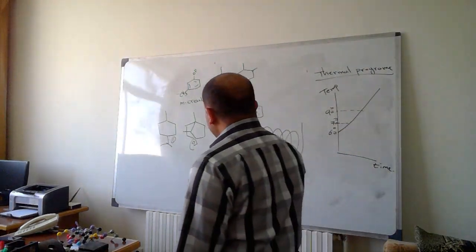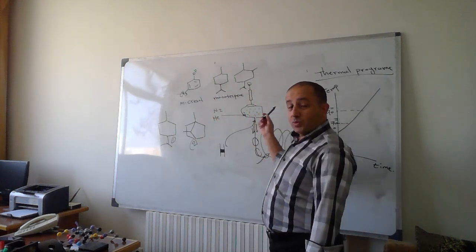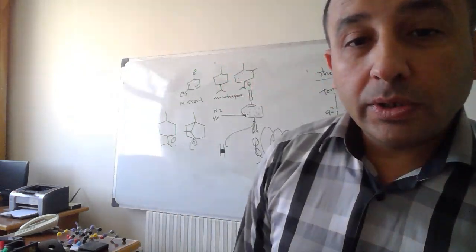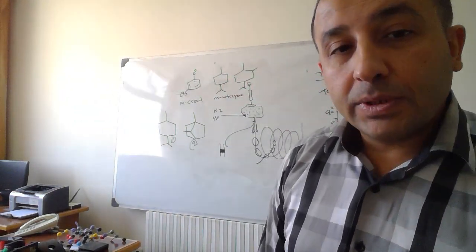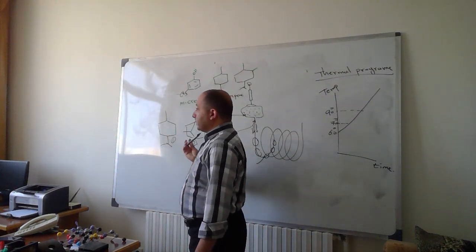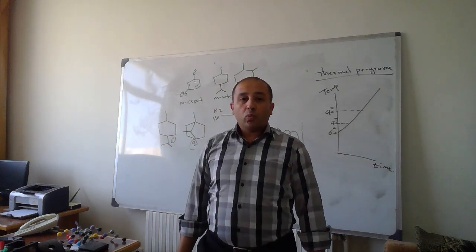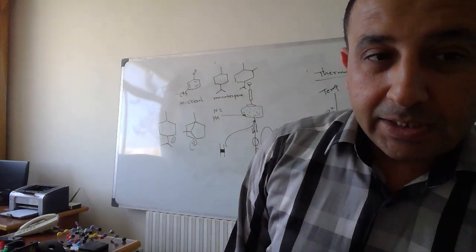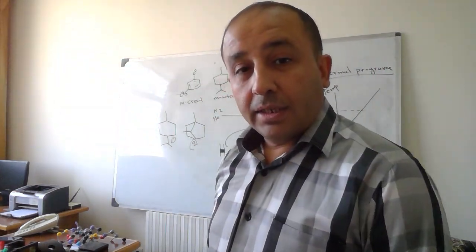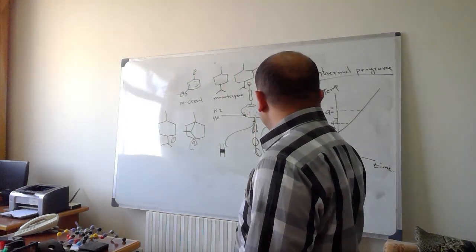So again, in addition to chromatographic separation as well as thermal programming, the shape factor will definitely contribute in separation. Now, two should be eluted before one due to its sphericity, and the movement of spherical particles will be faster.